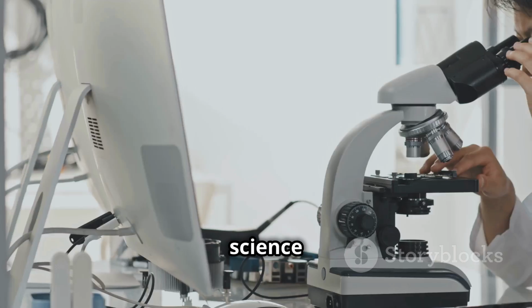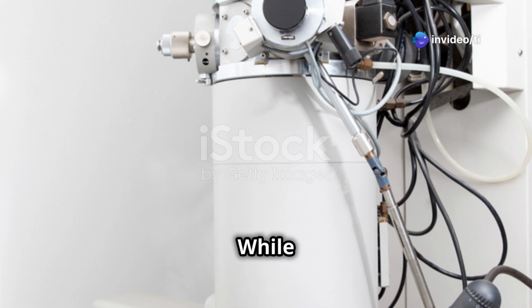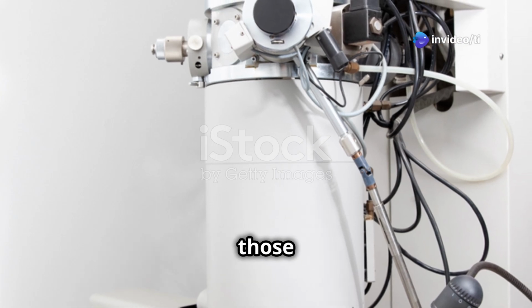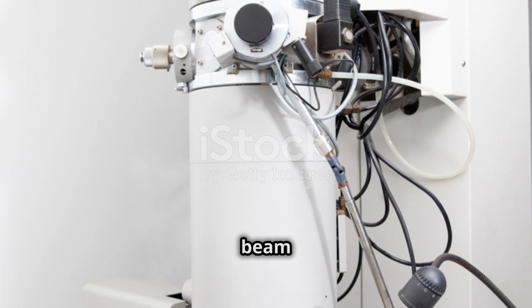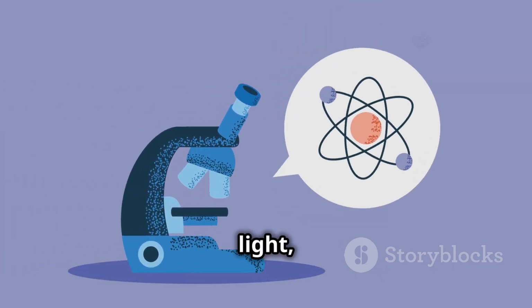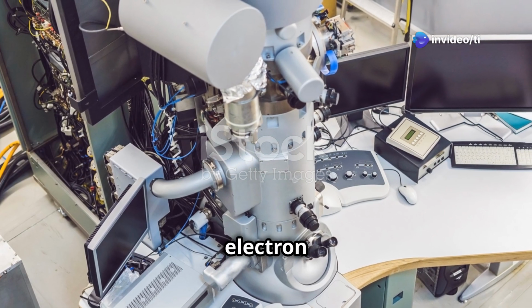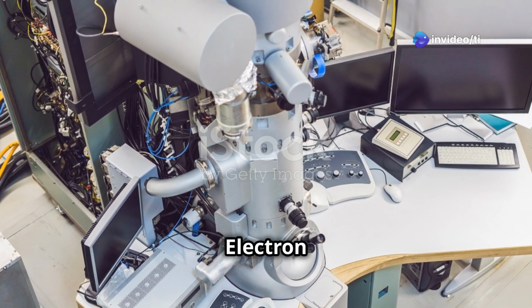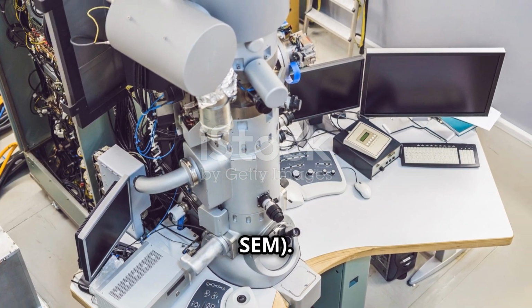Hold on to your hats, science fans, because we're about to enter the nano world with the electron microscope. While light microscopes use photons, those tiny packets of light, electron microscopes use a focused beam of electrons. Electrons have a much shorter wavelength than light, which means we can see even smaller things. There are two main types of electron microscopes: transmission electron microscopes, TEM, and scanning electron microscopes, SEM.